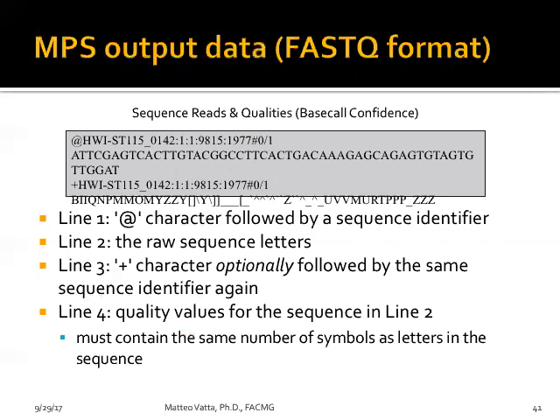So for PML-RARA and CML translocations, wouldn't it be easier to just do a real-time PCR assay instead of doing sequencing? Oh, yeah. It can be done by real-time PCR. It can be done in many ways. I'm just saying that this is another application of massively parallel sequencing, which can be done. So the mate pair is detecting gross events. Right, exactly. Implement those for treatment, because in PML you're looking for treatment within a day once you do the analysis.